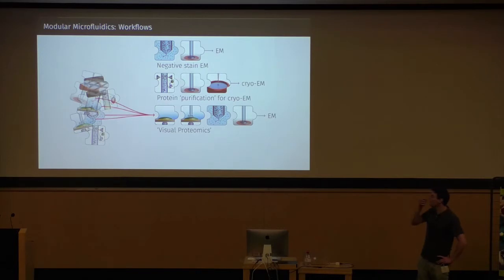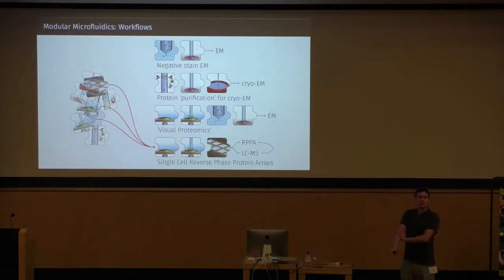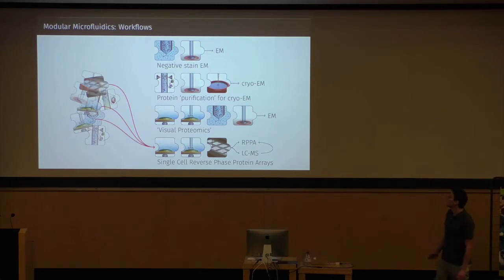Then for visual proteomics experiments, we would grow the cells in our setup, monitor them, lyse them, and prepare the lysate for the EM, in this case negative stain, but of course it would also be possible with cryo. And you can also do experiments not related to EM at all, like preparing single cell lysate for reverse phase protein arrays, as well as for liquid chromatography and mass spectrometry.